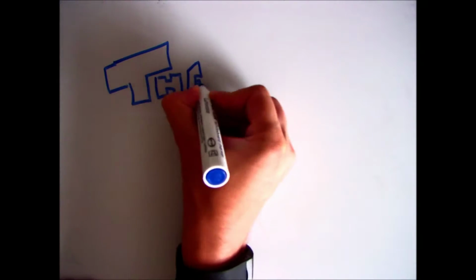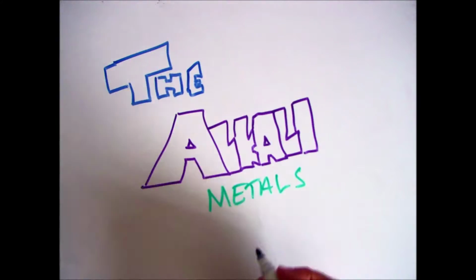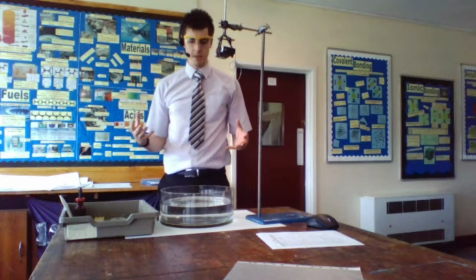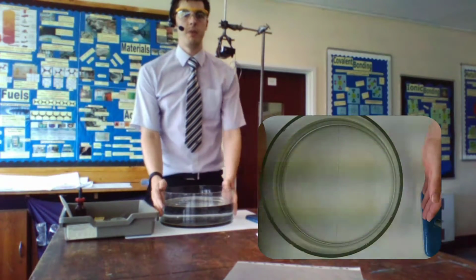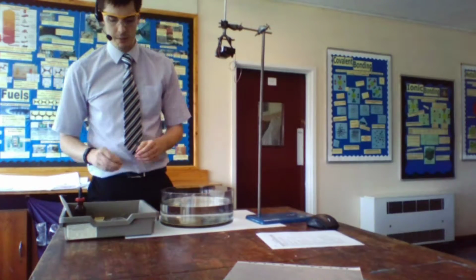Hello there and welcome to this video which is going to have a look at the alkali metals and in particular what happens when you put those alkali metals into water. Okay then, so to have a look at what happens when you put the alkali metals in water, first thing you need to do is get yourself a large bowl full of water and then 3 different metals.